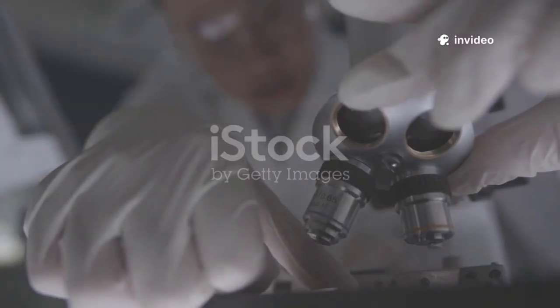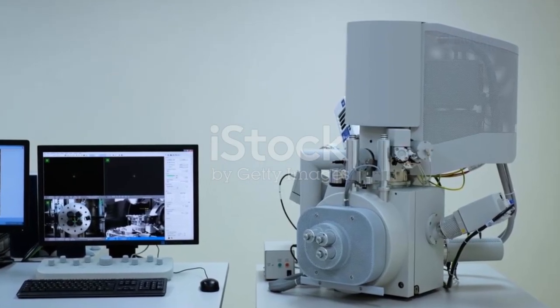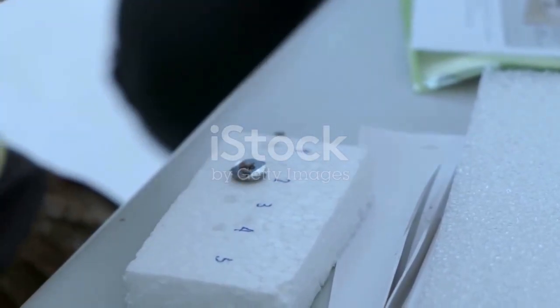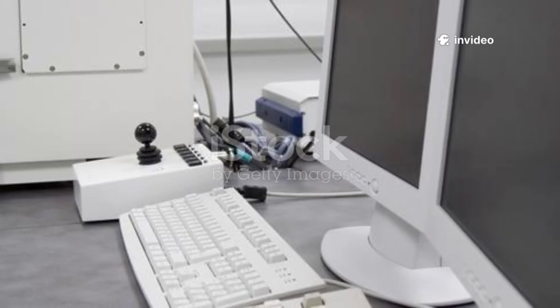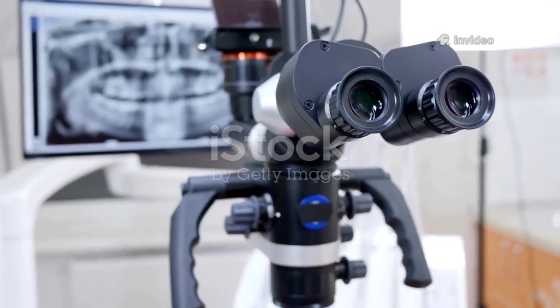So imagine a regular microscope. It uses light to magnify things, but there's a limit to how much detail you can see. SEM flips the script by using electrons instead of light. Here's how it works. First, you place your sample inside a vacuum chamber. Why? Because electrons don't play well with air. They need a clear path. Then, a superfine beam of electrons is fired at the sample from above, kind of like a supercharged flashlight, but with particles millions of times smaller than dust.